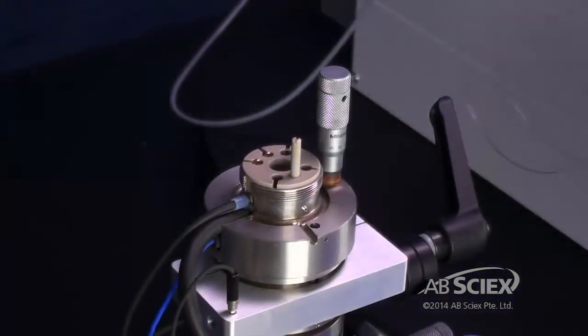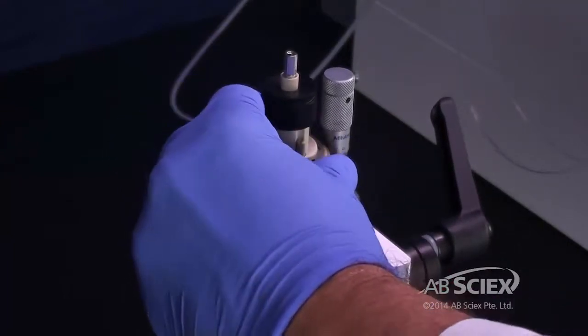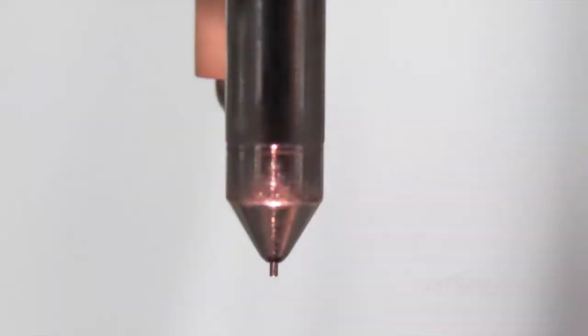Reinstall the probe and tighten the bronze retaining ring. Tighten the black electrode until 0.5 to 1 mm of the electrode tip protrudes from the probe.